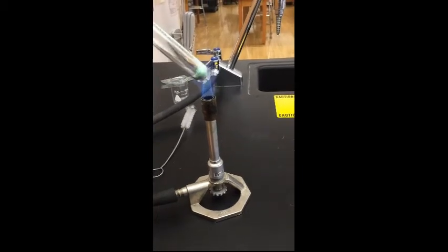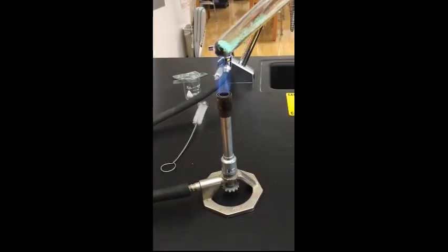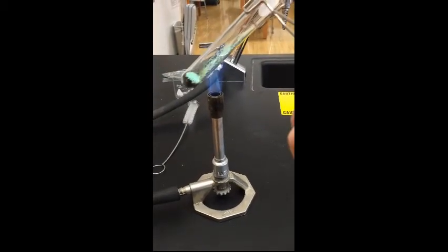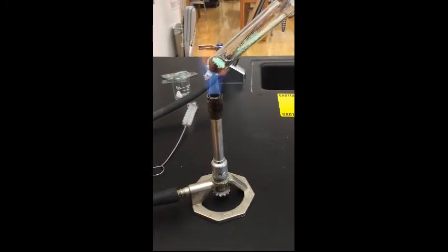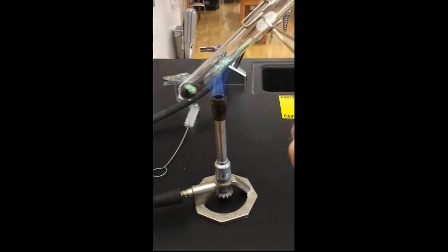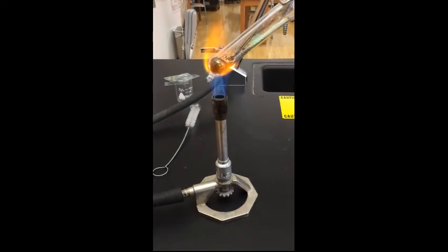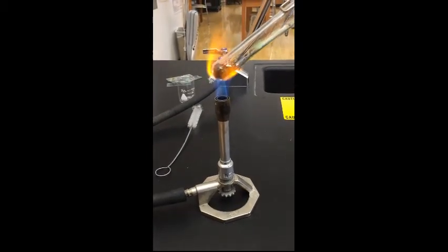If I heat something up too quickly, unless I know exactly what I'm dealing with, I'm not always sure of what's going to happen. So I'm going to try to keep this back and forth a little bit. So you can see what's happening.